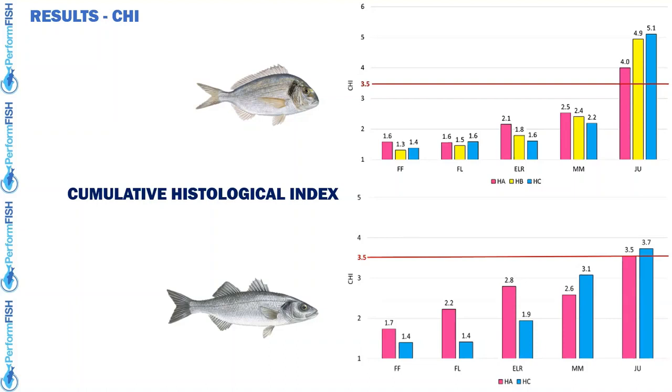Unfortunately, it's not possible now to analyze batch by batch and evaluate specific pathological patterns. It would take too long a time to do this, but things change for the juveniles, especially for gilthead sea bream. We have some alterations, but now I show you some situations.